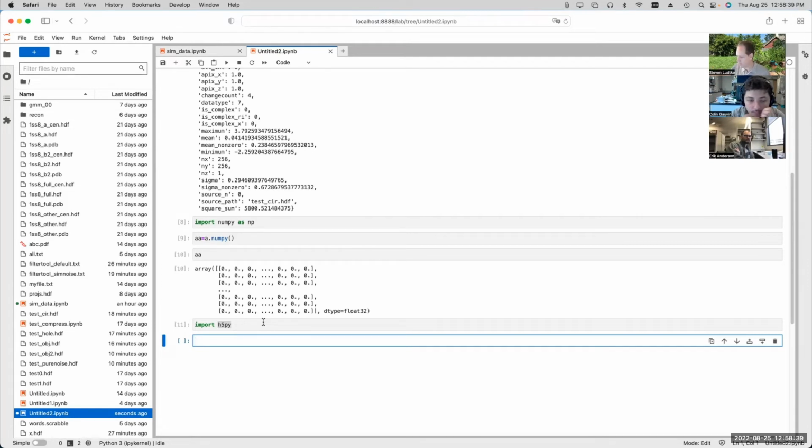So it'll write a TensorFlow tensor for the first layer, and then it'll write another one for the second layer, another for the third layer, all as separate files in the file system. So you don't have a file you can read again. You have a whole folder of files that you then have to read if you want to reload the network. Then it also provides an easy mechanism of dumping the whole TensorFlow trained network to an HDF5 file.